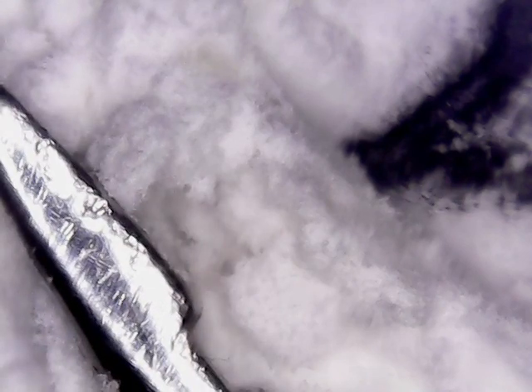Here's the thing. The reason I like using my own microscope is because I find this stuff interesting, but a lot of people will just put it under there and stare at it. I will do that sometimes, depending on what it is. If it's an ant, well yeah, because it moves by itself. If it's certain powders that are just giant chunks, I'll leave it because it doesn't do much. But with stuff like this, you can really see how it actually works when you move it. Look at that chunk — the rest of it, it's not connected. I mean, it is, but it isn't. That is just amazing.